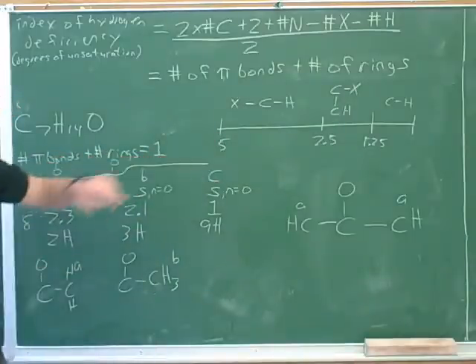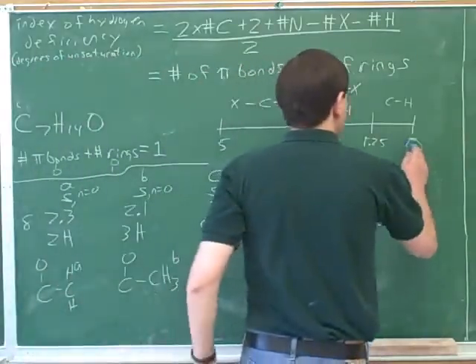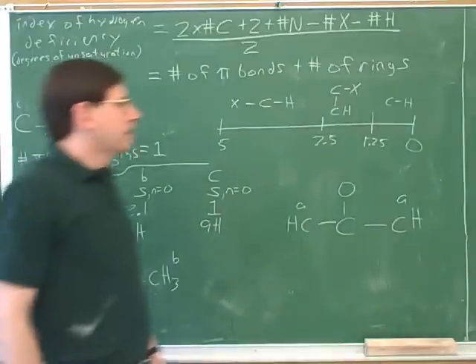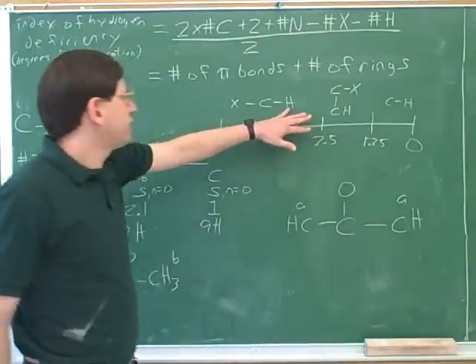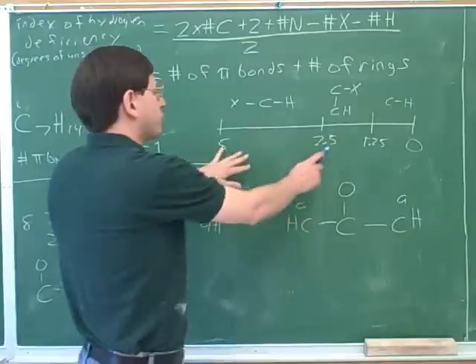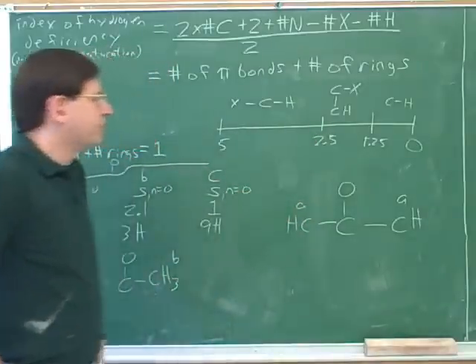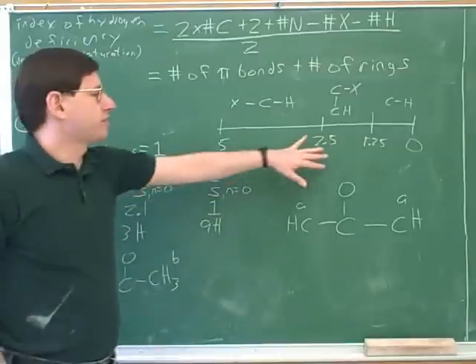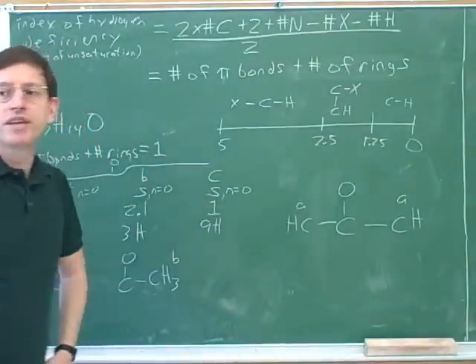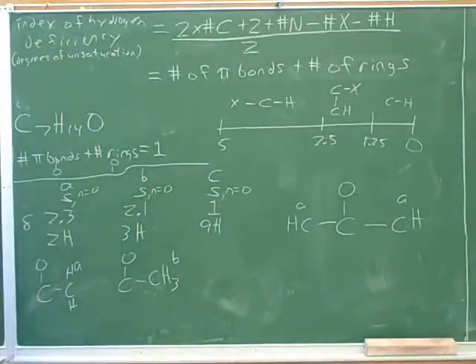So if you look at the chemical shifts for proton NMR, this is a good rule of thumb. If the hydrogen is attached to a carbon that's attached to an electronegative element, that tends to be absorbing in this region, 2.5 to 5. Usually closer to 2.5, but if something's really electronegative, we can be closer to 5. One thing we saw is that electronegative elements tend to pull us to the left in chemical shift.